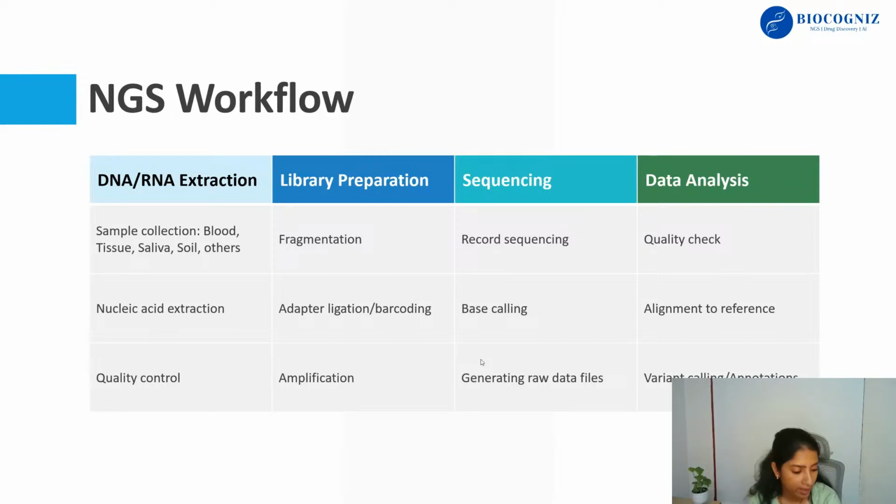When we extract the DNA or the genetic material, we have some amount of DNA present in our hands. Then the technique works by fragmenting the entire DNA using certain techniques on the wet lab side, and we add adapters and indexes according to the problem we are trying to solve, and we amplify it for improving our confidence in sequencing. So once that step is done, the third step is sequencing.